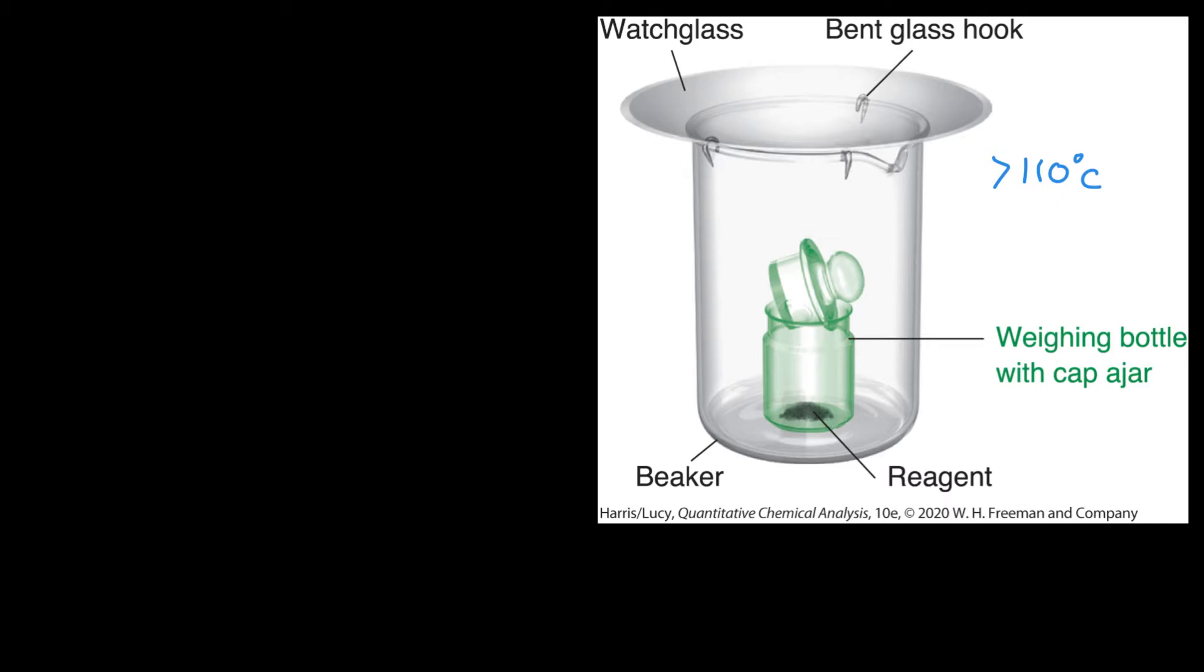Once it has been dried, it needs to cool down. We could just take everything out and put it on the countertop, but one problem is that moisture can condense upon the surfaces. As it cools, it can actually increase in weight and retain a little bit of water. So what we normally do is this.